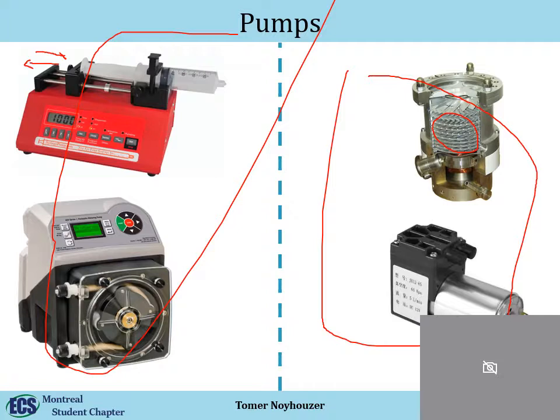And some of them actually have the ability to have several syringes, so you can have several different types of liquids. And again, very simple, very easy to use. I will actually start with one of those if I needed to. And you have a peristaltic pump, also programmable, also for larger volumes.